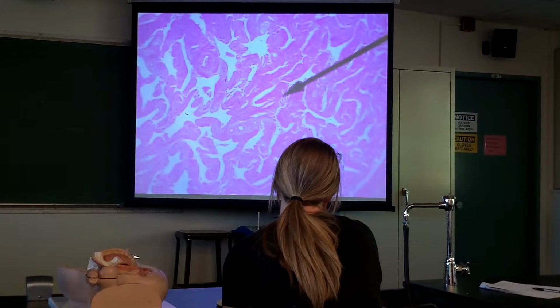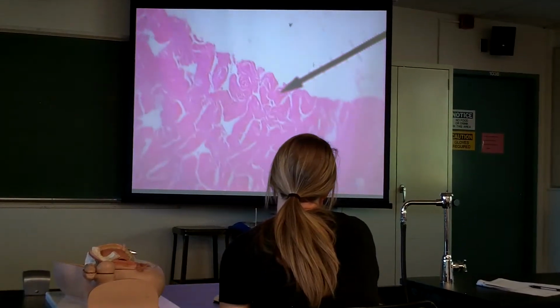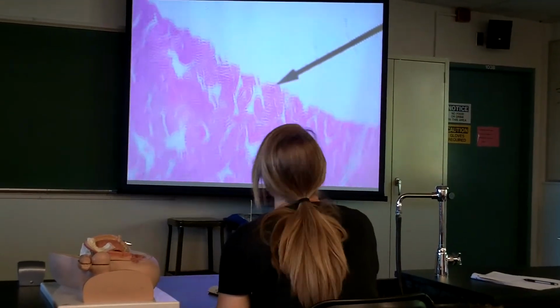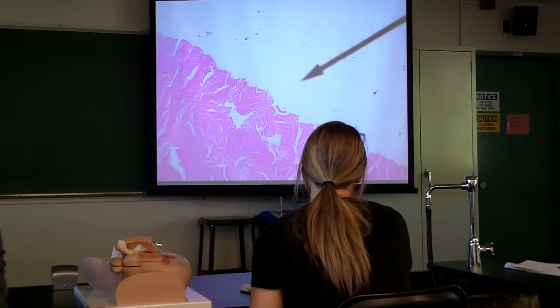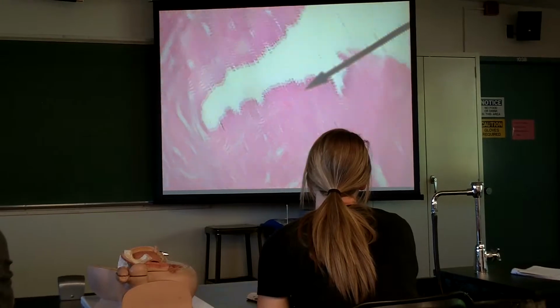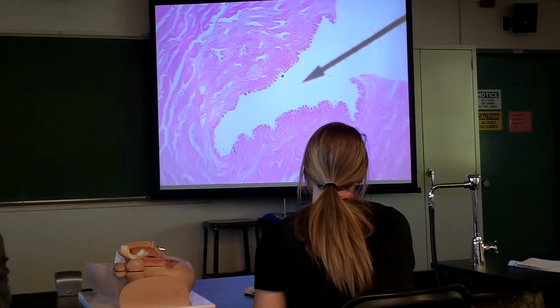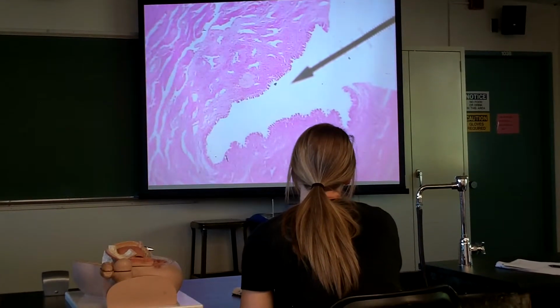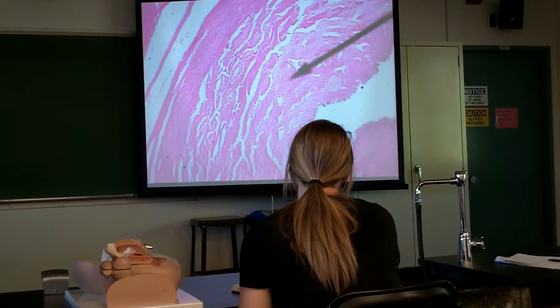Let's look for our urethra. Remember, we're only going to see half of a urethra, because this whole thing was cut in half, right along here. This was the cut line. There we go. So follow that. Here's my half a urethra. So you can see again the kind of undulating shape of the urethra. You can see it's lined by some sort of epithelium. So there's your urethra, which means this erectile tissue that immediately surrounds it is the corpus spongiosum.